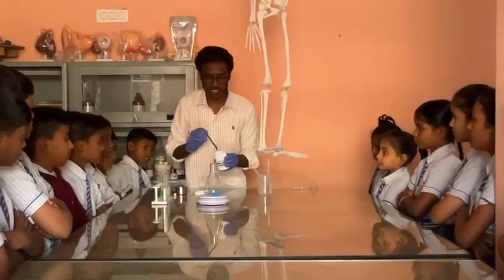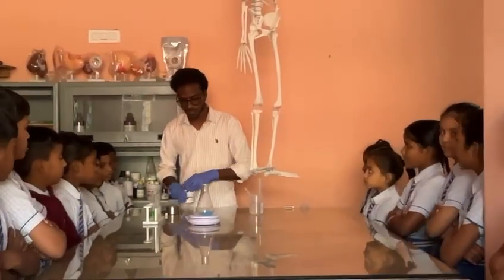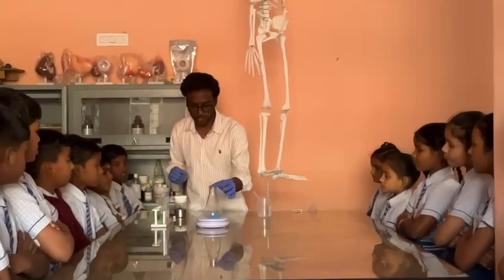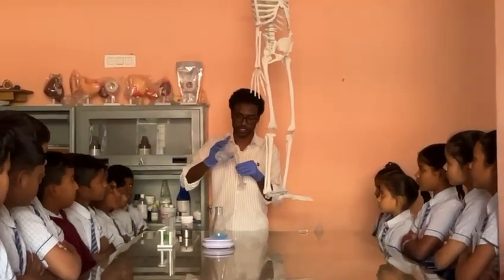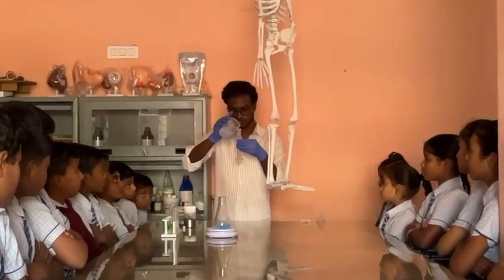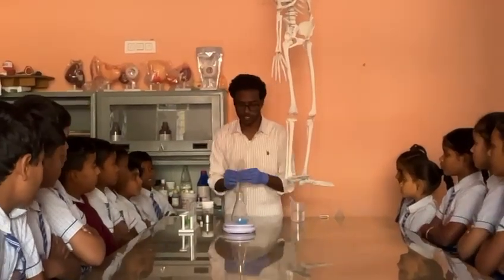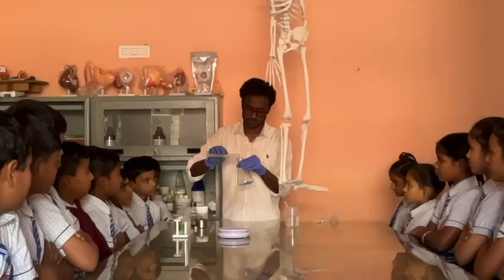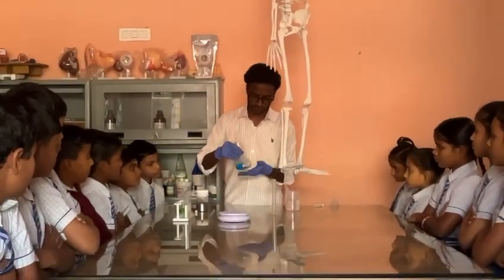This is 10 grams of copper sulfate, and we need to make it a solution. So I'll add 10 ml of distilled water. We'll take 15 ml of distilled water to dissolve and mix this solution.